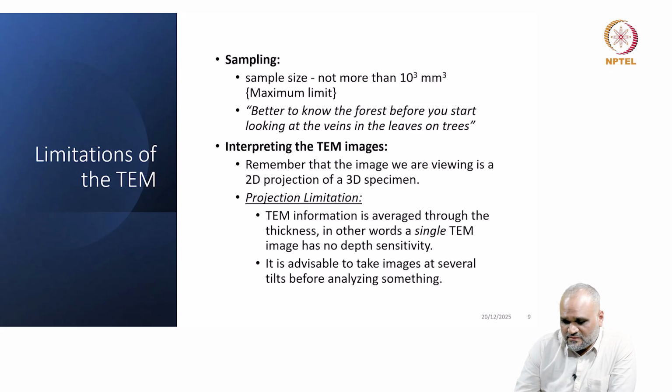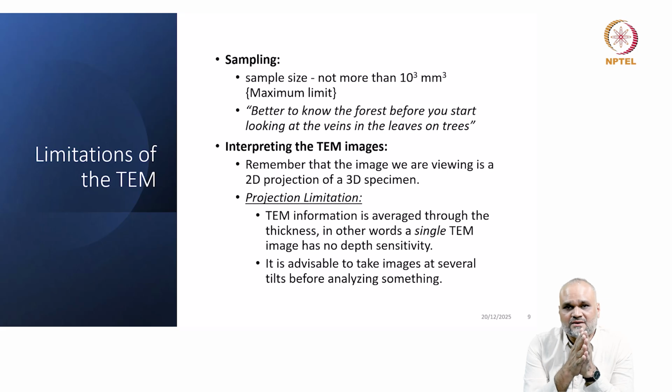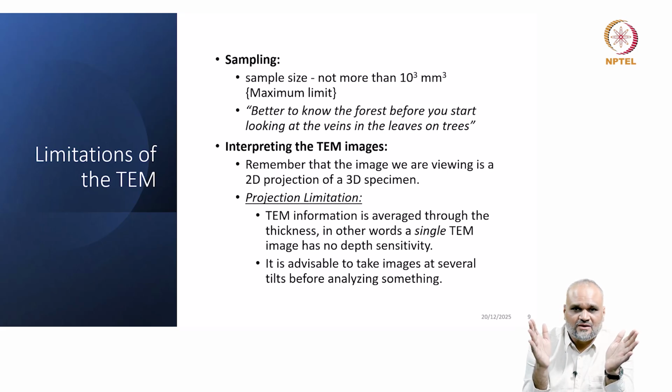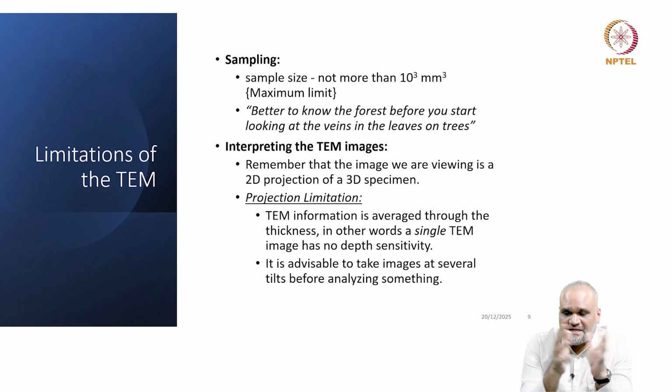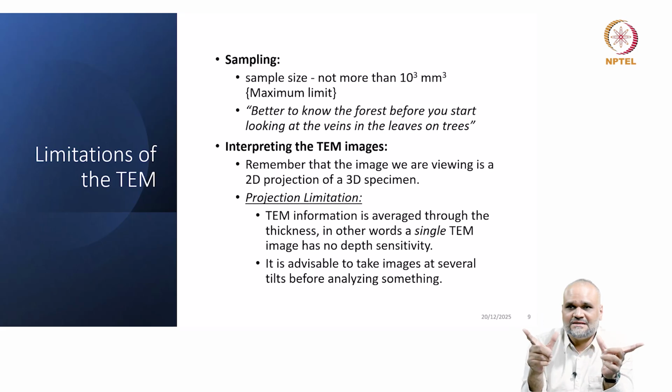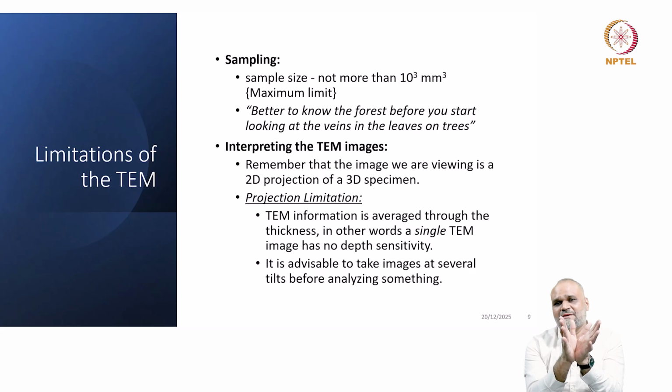If you draw a parallel to how you see a movie in 3D, you're recording information of an object from two different cameras at a different angle, and you use either stereoscopic imaging, or, depending on what kind of spectacles you use, polarized spectacles, where you can form a three-dimensional image of an object.